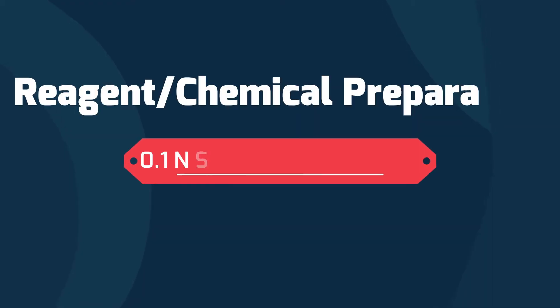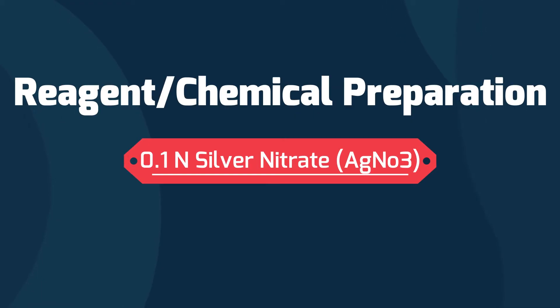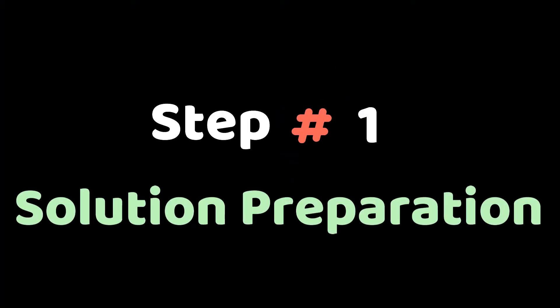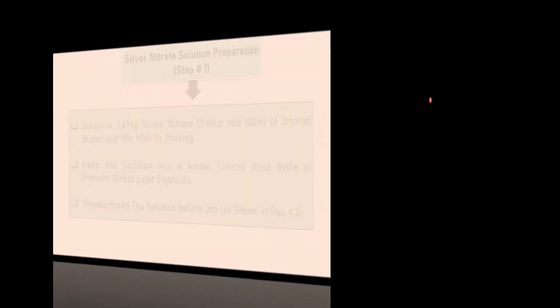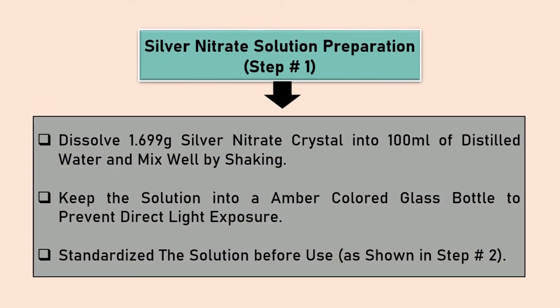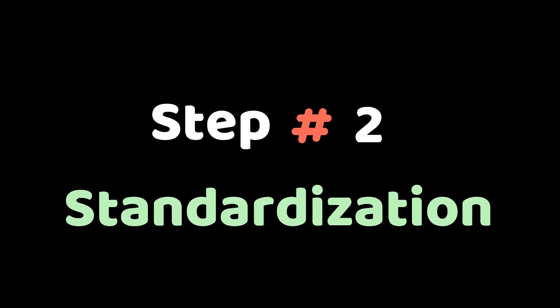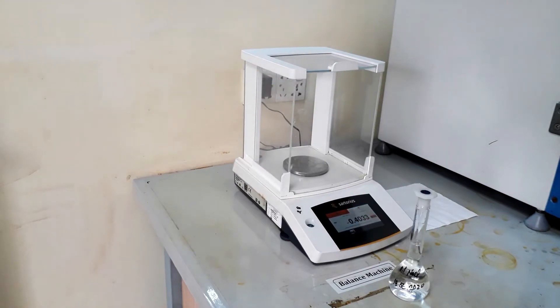Now we will prepare 0.1 normal silver nitrate solution. This can be done by following two steps. In the first step we will prepare the silver nitrate solution by dissolving 1.699 grams of silver nitrate crystal into 100 milliliters of distilled water. Use an amber colored glass bottle to avoid direct sunlight exposure, and always store it in a dark and cool place. In the second step we will do the standardization of the newly prepared silver nitrate solution.